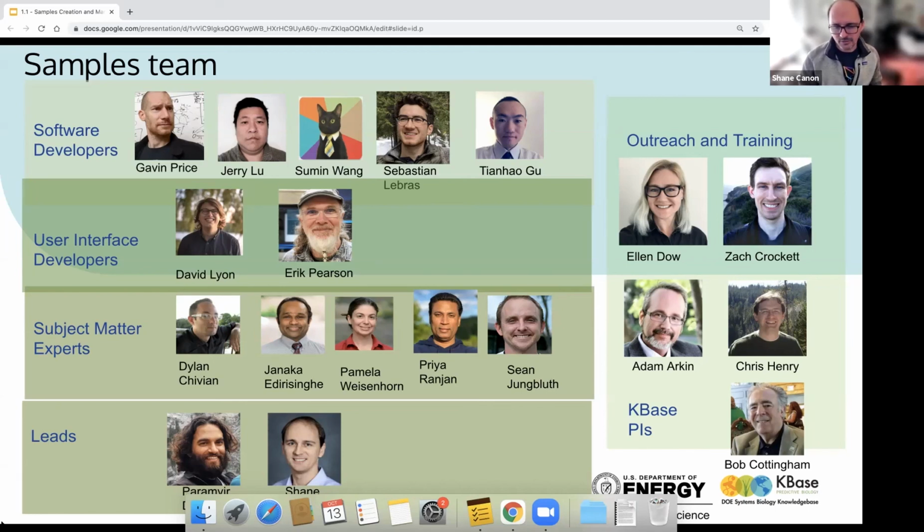I think there are others where it's a little bit fuzzier. And so if people come to us with terms, part of the conversation is trying to figure out, is this something where we need another measurement type or another object type to capture these fields, or is it something that makes sense to just put into the sample attributes? And it could be that that changes over time as well. So it's definitely an evolving picture, I would say.